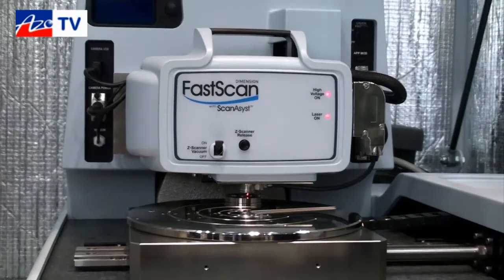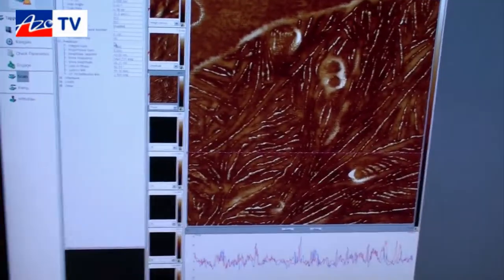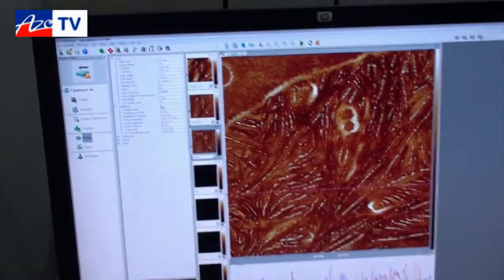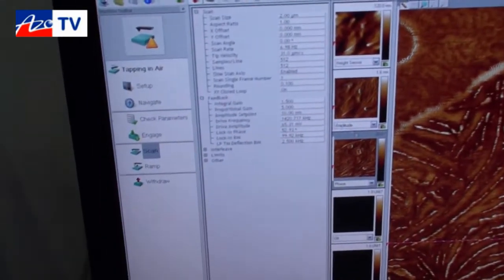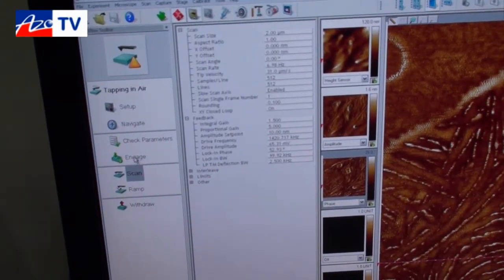The system is basically controlled by the software over here. It's a very simple to use interface where you basically step down the side here in order to set up a scan. Right now I'm not actually engaged, but I'm going to go ahead and engage it so you can see it in action. I'll click on engage.